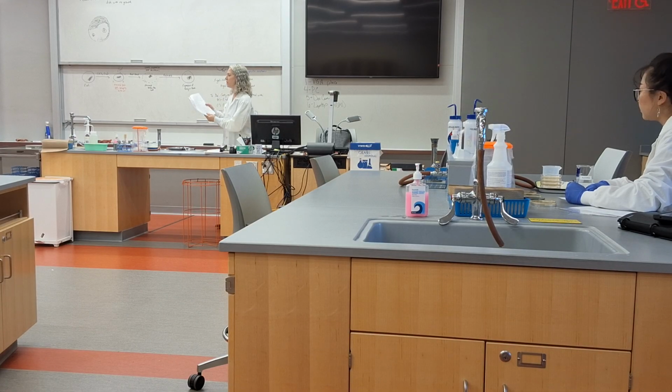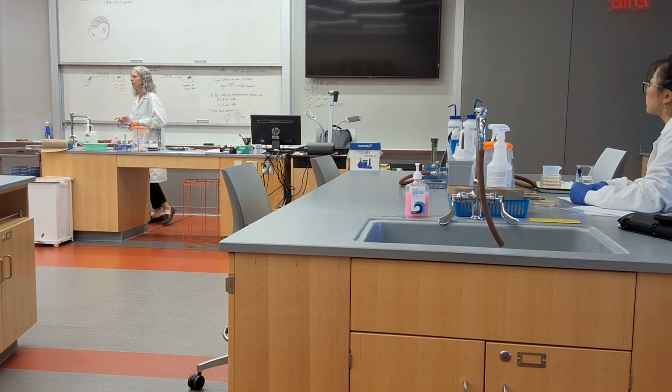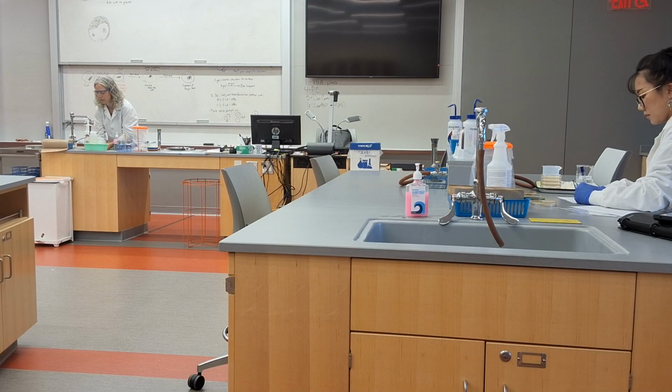Okay, so you have on page 3 or so, the protocol. You all have that tray, hopefully, from group. You are going to take one sterile tube, and it should be those, we call them flip cap tubes, that are clear in color, in your little rack.